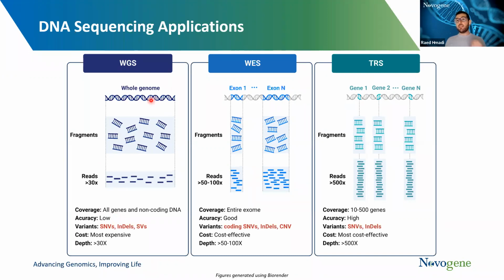And then, of course, any mismatches that might have happened during library preparation or sequencing will not be eventually corrected. However, with whole exome sequencing, if now you concentrate these 1 million reads on 1% of the genome, then you are sequencing them more. And then, of course, you have more confidence and high accuracy in the data that you obtain. This is why the accuracy is better.